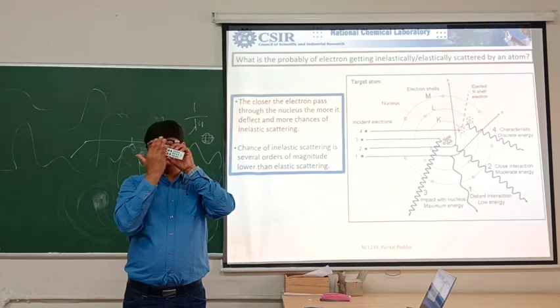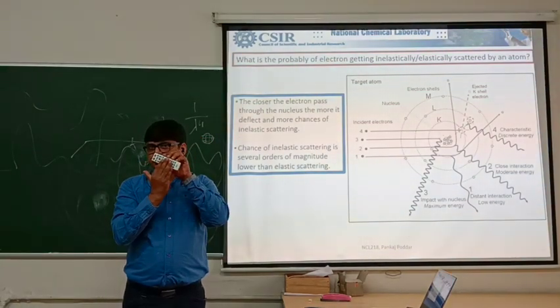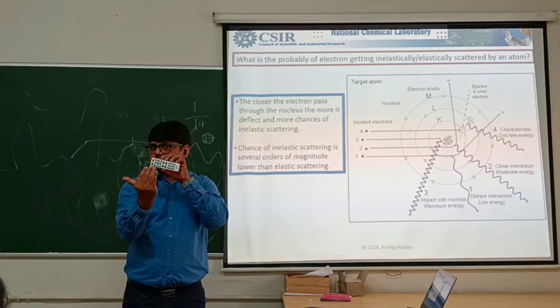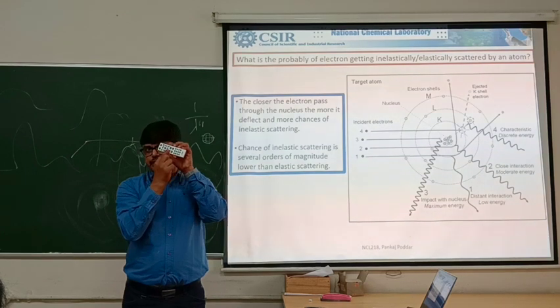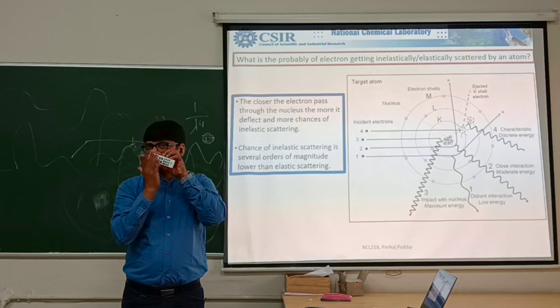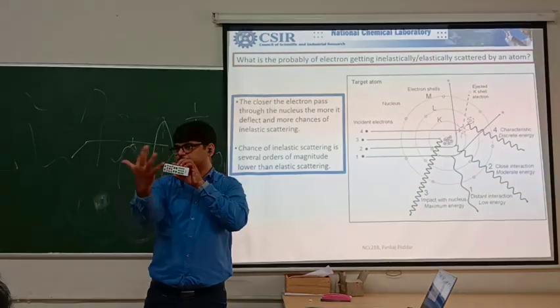If you coat uniformly only 10 nanometers, what will happen is that all the area is shifted by the same thickness. So suppose you are interested in the topography of these metals. This topography is not affected because you are uniformly lifting the entire background by 10 nanometers, the same amount, right?